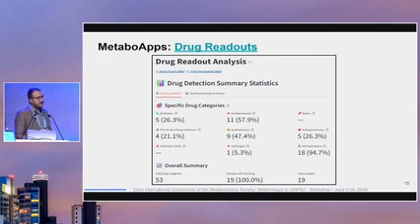So this is going to be the initial summary when you click on run analysis. For people that are following these steps on your computer, if you're having any trouble or any errors, just raise your hand and we'll try to solve that. As I said, the idea is to be as interactive as possible. So this is the initial summary that is going to be populated on your screen right now.